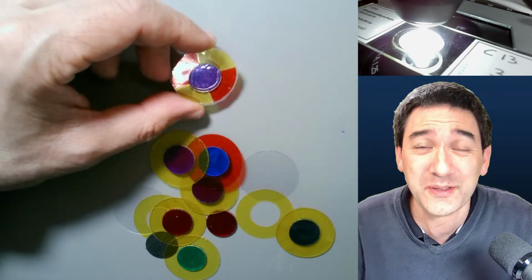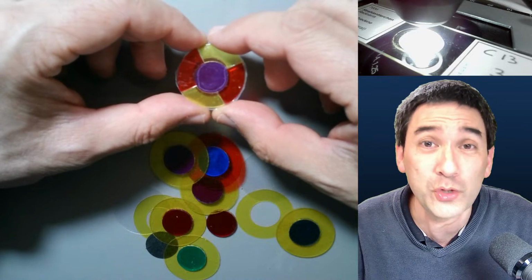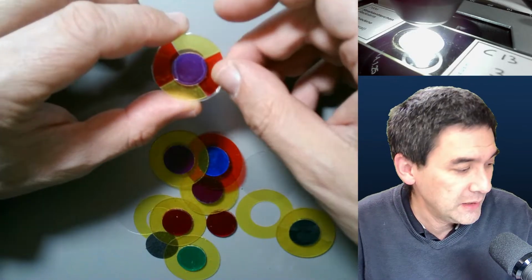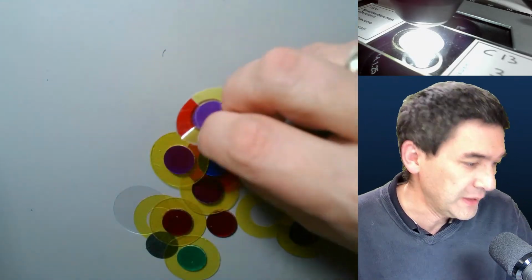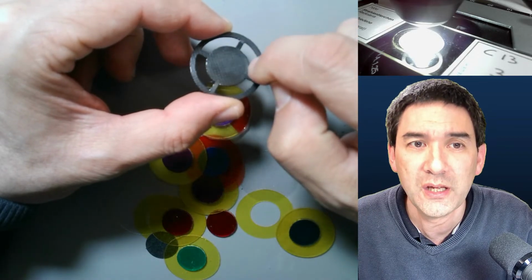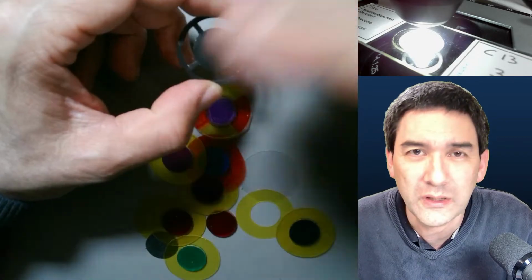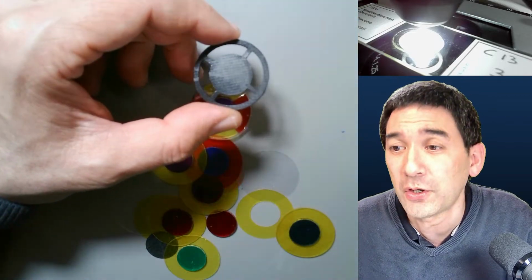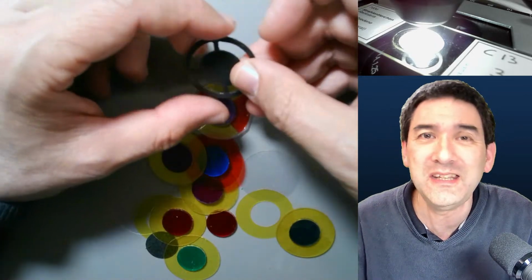So this is the really difficult thing: you need phase contrast objectives, and then you are able to actually make your own, not with color. I don't even know where I put it now. Oh yeah, here. You're able to make your own phase contrast filters by having a ring of light here. But this has to be really carefully measured out. I know that this is possible because some people have done that, and I've read some reports online. But it's not the easiest thing to do.